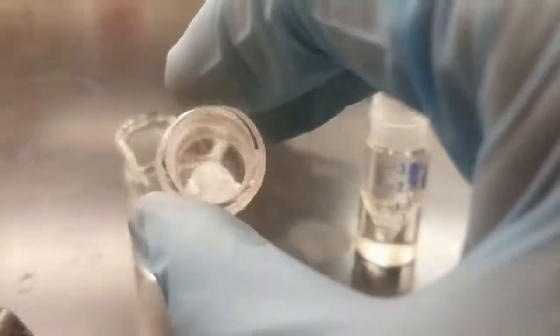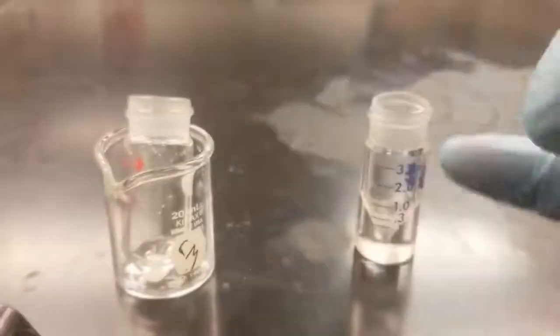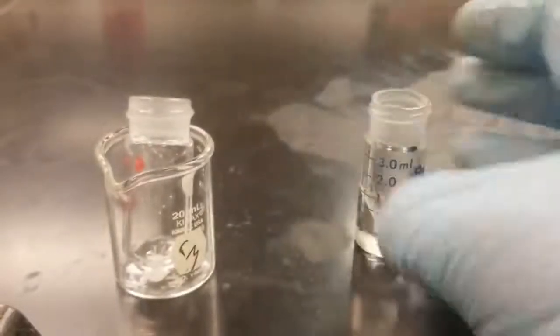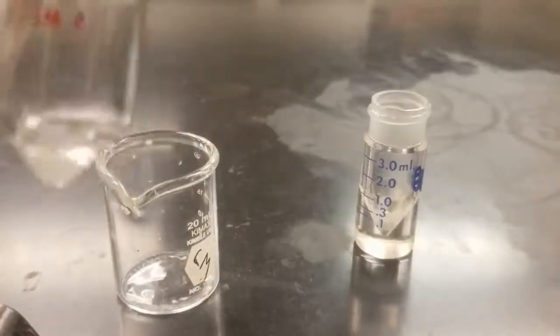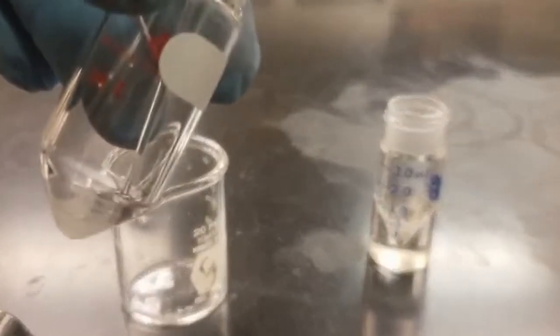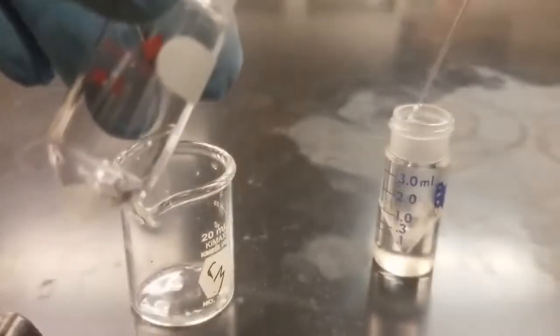All right, so we've got our methylene chloride right here with our sodium sulfate in there. You can see it should be all dried up. It's been over 10 minutes now. And we're going to go ahead and transfer it over in this pre-tared vial that has a boiling chip inside of it. So we'll go ahead and take our filter pipette and just try to suck up the liquid and not try to pick up any of the sodium sulfate. Transfer it over.